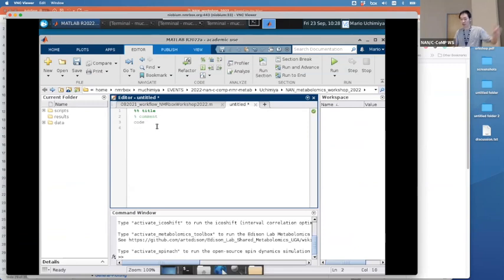Now we see three different things. The first one is two percent symbols. That's a title in MATLAB, and they are in green. The next thing is one percent symbol. That's a comment. They are also in green. And when you see green lines, they are not code, so you don't need to run them. If you click on run section, nothing happens because they are not code. Code is always in black.